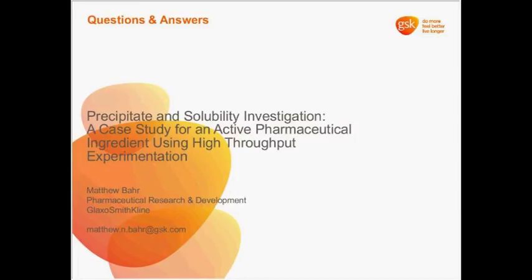If I try to run these at 30 minutes, then I'm really looking at a large window of time that it would take to run those replicates at very short time frames. So dissolution testing is probably very appropriate if you're looking to see the drug concentration profile at very short periods.